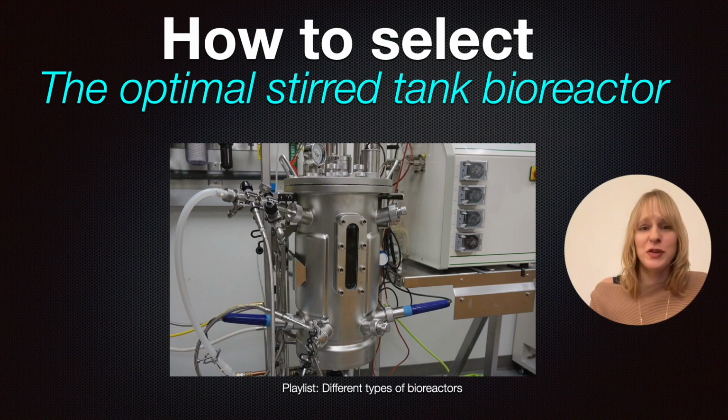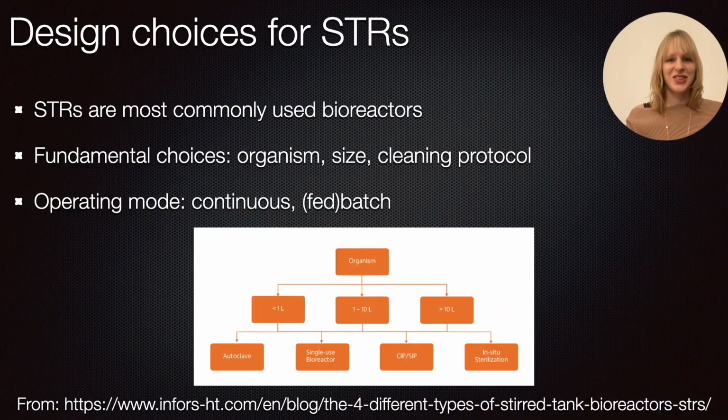I am Professor Marloes Peeters and I have different playlists on bioreactors, and in this short video I'm going to explain to you how you can make sense of all of this and how you can select the optimal stirred tank bioreactor for your application. So there are different design choices for these stirred tank bioreactors, and as I said before, these are the most commonly used ones at the moment and they're still kind of the industry standard.